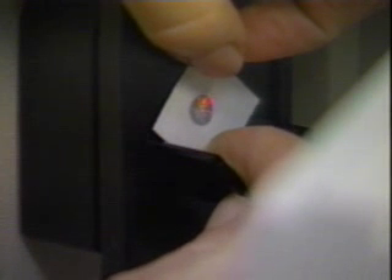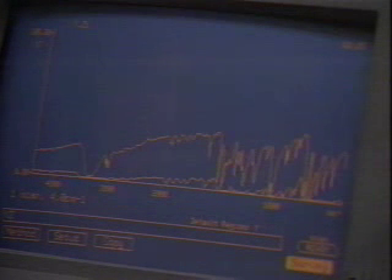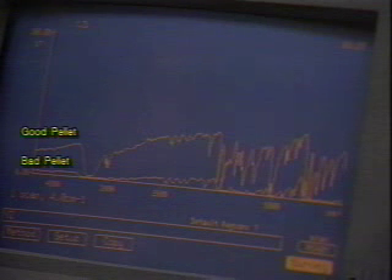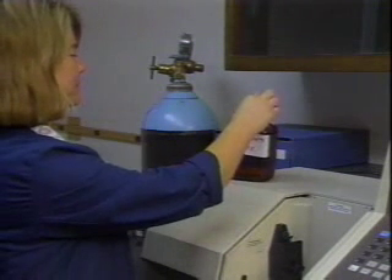Good KBr pellets are transparent, compared to improperly prepared pellets which are opaque. Too much KBr or sample, insufficient grinding, or insufficient pressing can all cause the pellets to be opaque. The KBr pellet is placed on the sample holder in the spectrometer. The spectrum of the KBr pellet of benzhydrol shows good sharp bands. Compare this with the spectrum of an improperly prepared KBr pellet — note the decrease in percent transmission. As with thin films, sample preparation has a large effect on the quality of an FTIR spectrum. Used KBr pellets go into the jar labeled 'waste KBr pellets.'